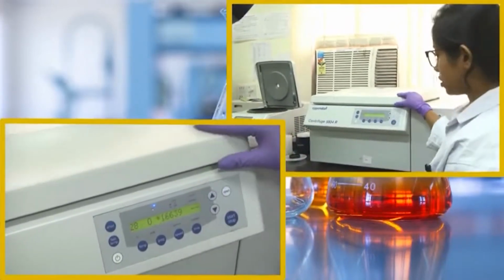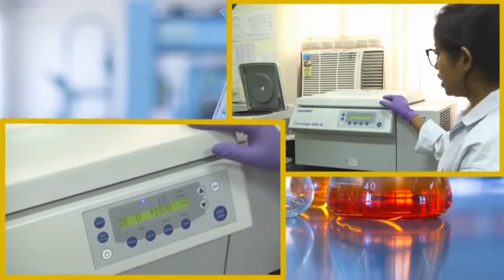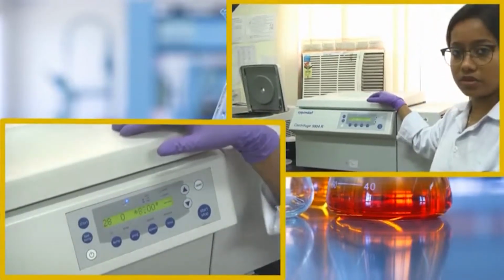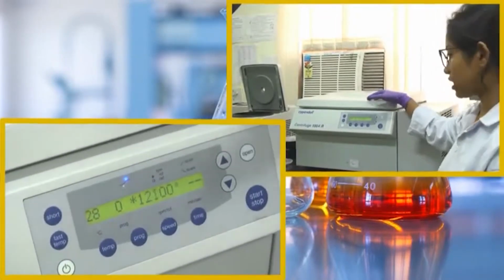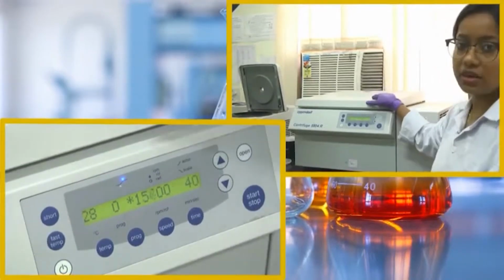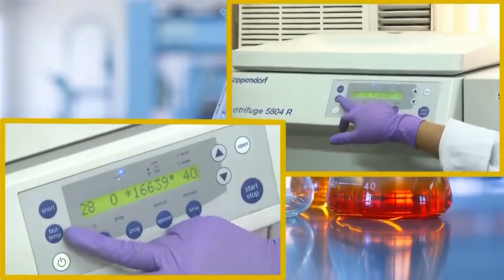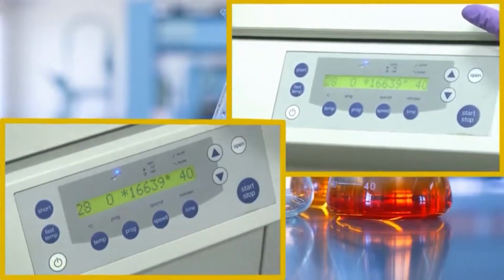If your sample is too heat sensitive, if you want to go for an absolutely cold temperature, you should first go for a fast temperature change, make the centrifuge 4 degrees centigrade, and then put your sample and go for the centrifugation process. Our protein is not that heat sensitive, so it can withstand normal temperature like 37 or so on. So, we are not doing that, but if you need, you can do that as well. There is a mode for fast temperature. Without your sample, it will start rotating and make the rotor 4 degrees centigrade. Then you open it and put your sample inside it.